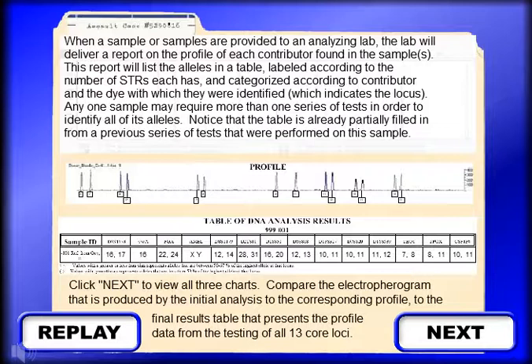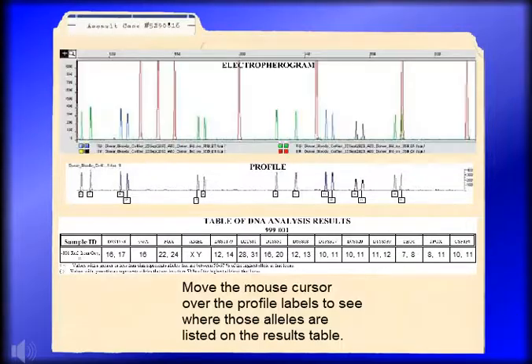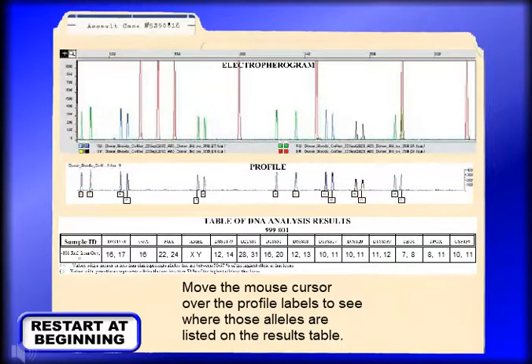Click Next to view all three charts. Compare the electropherogram that is produced by the initial analysis to the corresponding profile, to the final results table that presents the profile data from the testing of all 13 core loci. Move the mouse cursor over the profile labels to see where those alleles are listed on the results table.